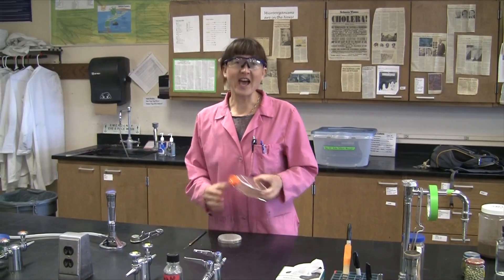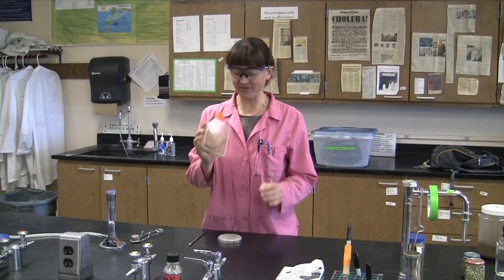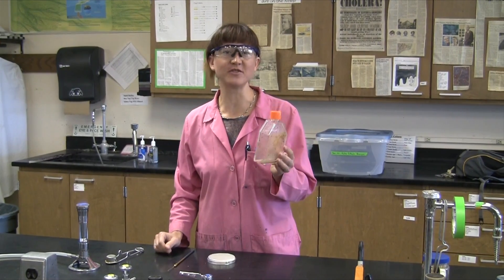Last time when we left off, we had put some soil into a nitrogen-free agar or nitrogen-free broth and we were trying to isolate only those organisms that could fix their own nitrogen out of the atmosphere.